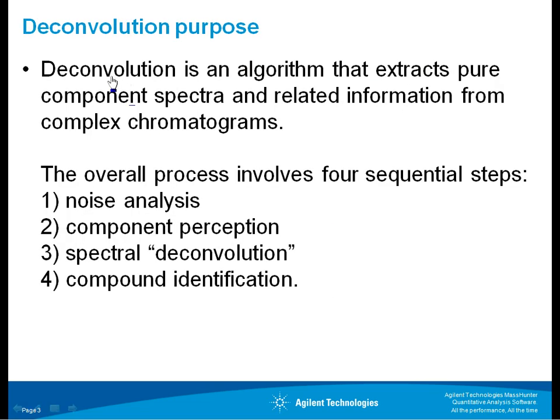The purpose of deconvolution is basically an algorithm that extracts pure component spectra from complex chromatograms. And as always pointed out, there are four major steps. The noise analysis, which I mentioned being done by the integrator. There's component perception, spectral deconvolution, grouping the ions together that fit a model peak shape, and then last, using the library to do a compound identification, spectrally matching.